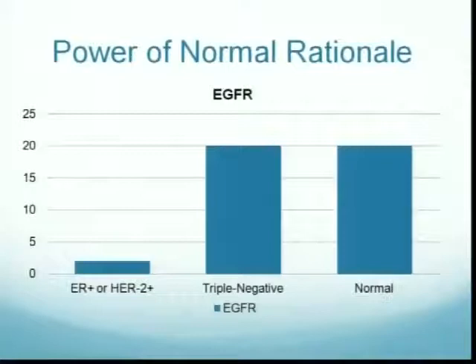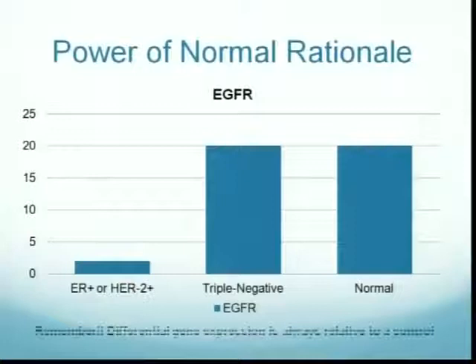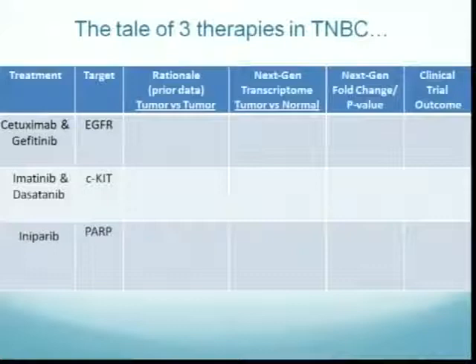So always remember, fold change in differential expression is always relative to a certain control. And you say, Milan, okay, that's pretty obvious. Well, how does that play out in the real world? So this is actually a comprehensive table of almost all the targeted therapies tested in triple negative breast cancer.